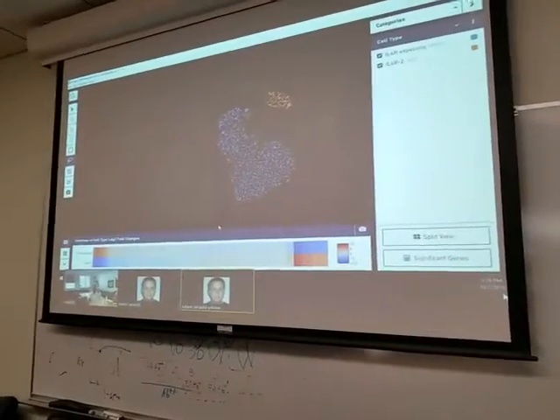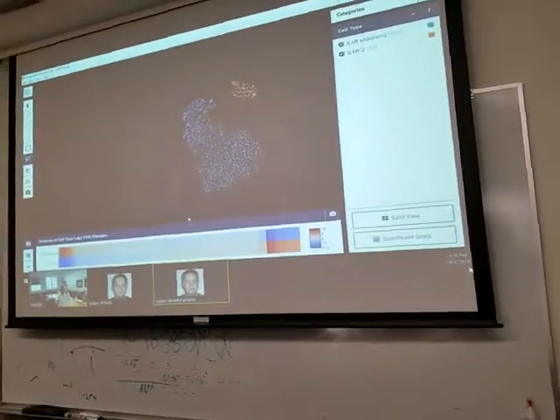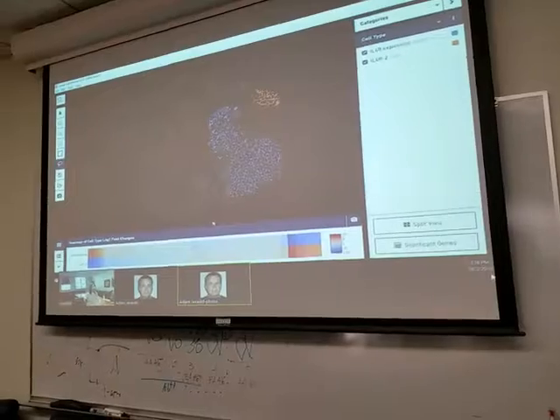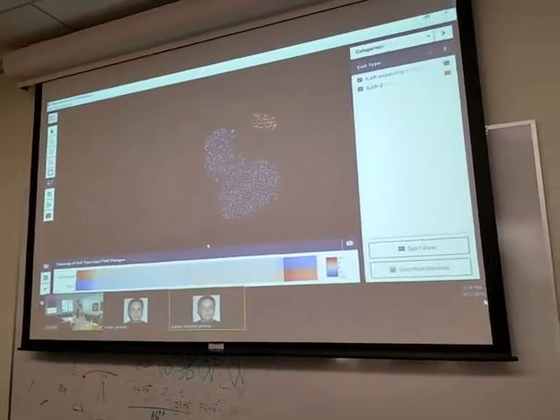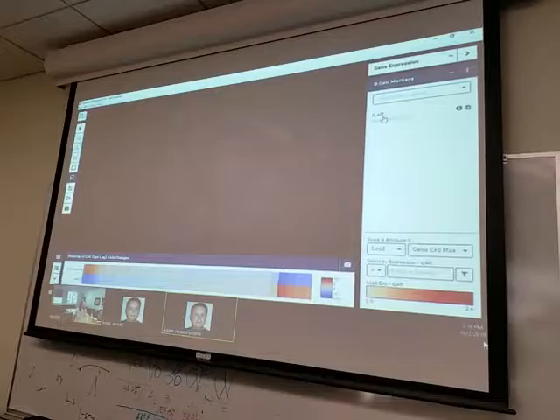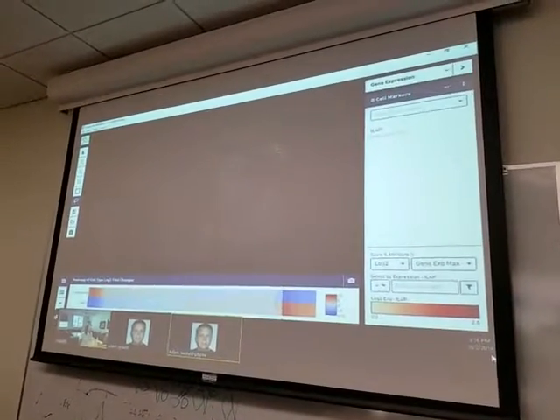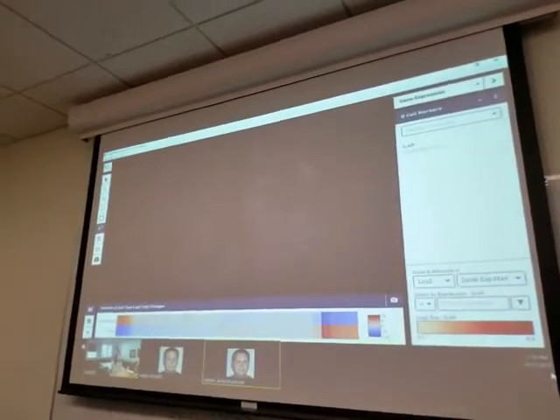All right. Can you pull out, this is a little tougher question, I think, the IL-4 receptor expressing cells and look at their barcodes? Yeah, so if we go back to gene expression. So we did that using the lasso, right? The lasso is somewhat subjective.